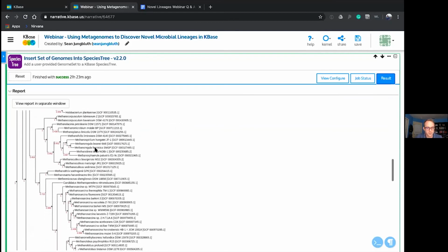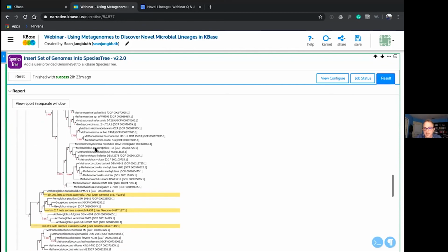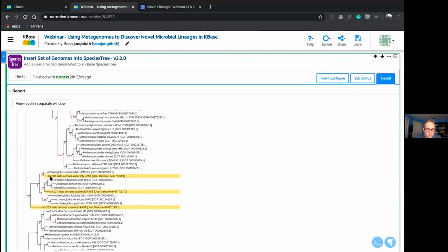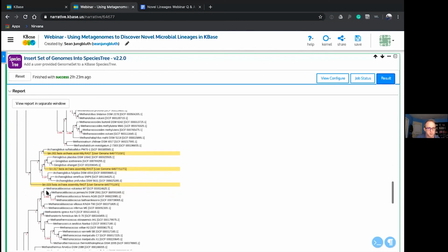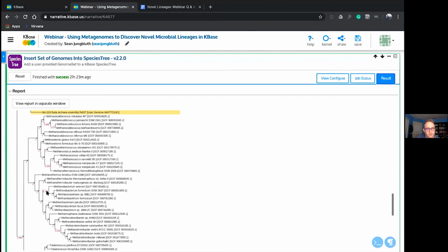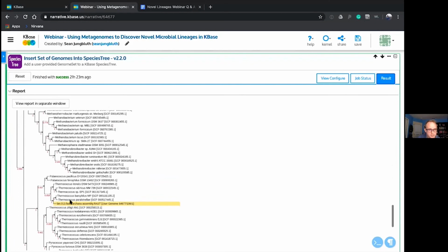Also noteworthy, compared to the GTDB TK tool, here we have some phylogenetic context for our lineages. We can sense the relatedness and the distances using this tree here, which is fantastic. Here we have, it looks like, a cluster of our Archaeoglobi genomes. This looks like a fairly divergent Archaeoglobi, which is consistent with a divergent Archaeoglobi we published on and had some methane related genes, methane cycling related genes.